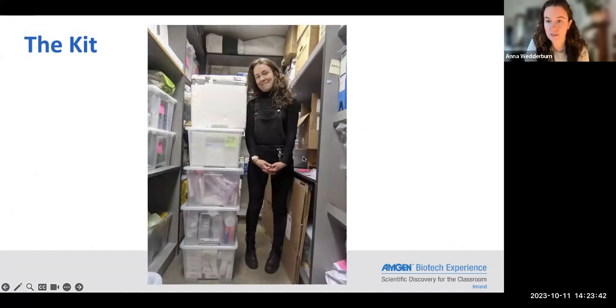Just so you know, before we get going as well, this is the size of the kit. This is a picture of me beside the kit. I'm 5'4"-ish, slightly under, and you can see that there's 5 boxes, sometimes a small 6th one as well, and so it takes up quite a lot of space. So bring an empty car when you're going to collect the kit. These boxes contain all the equipment and consumables you need. The only thing we don't provide is a water bath, which is needed for lab 3.